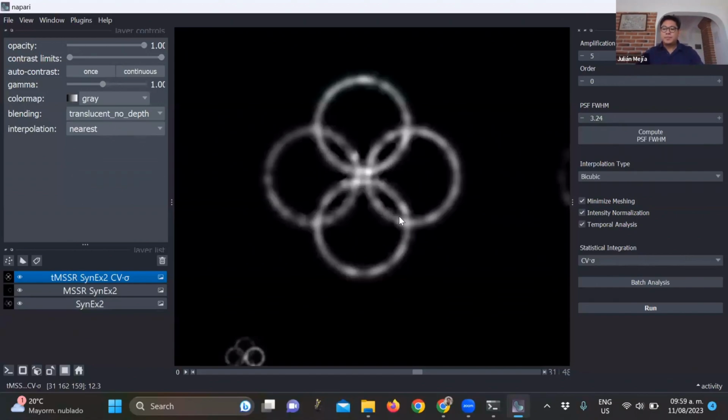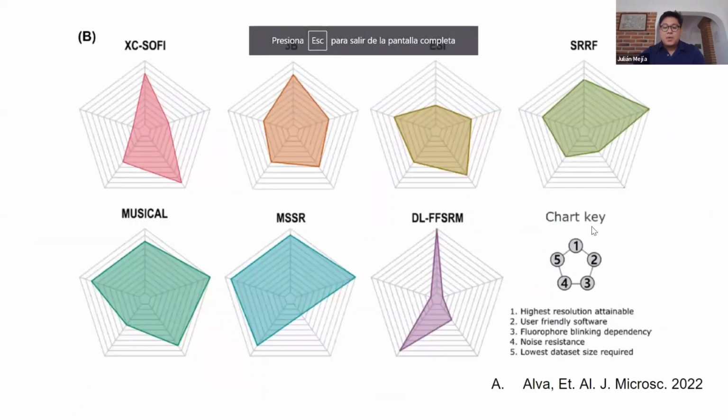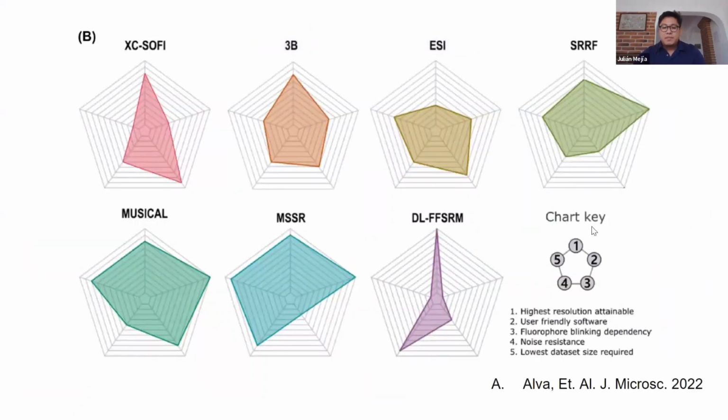So to wrap up this presentation, all the methods are different, and they perform differently with different data sets. So be curious, explore all of them, and try to see which one is the best for you. And once you reach the parameter part, be curious and play with it too. I hope that after this presentation, you have some criteria for what it means to explore these parameters.